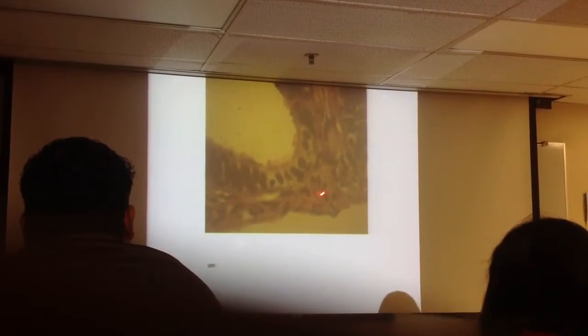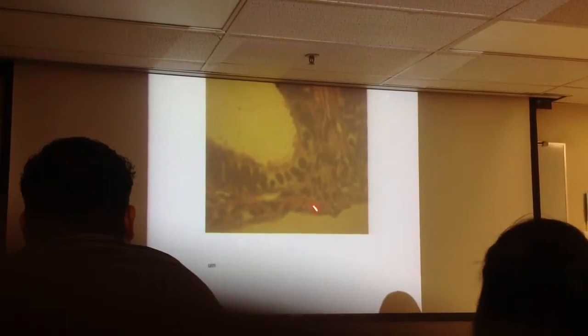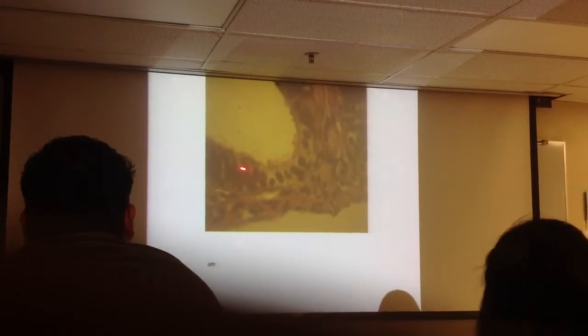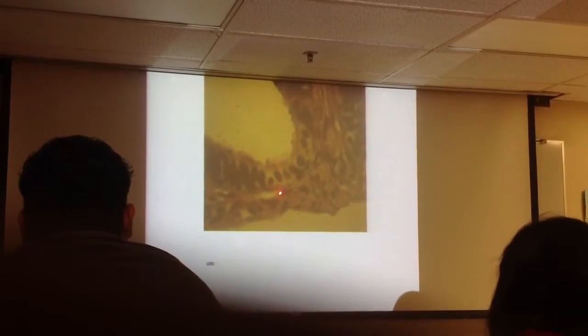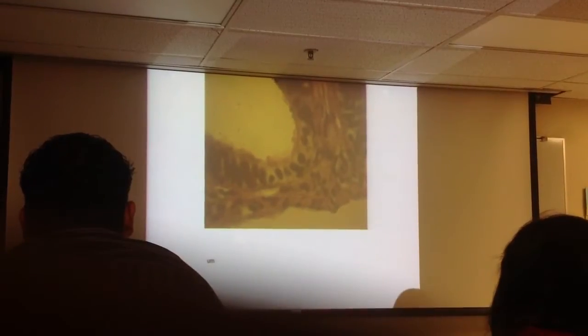What broad category of tissue is this? Connective. So that is lumen, and this is a tear. Because lining the lumen all the way around would be some kind of epithelial tissue, in this case simple ciliated columnar. Down here, no, that's connective tissue, and it doesn't line a lumen, so that's a tear.